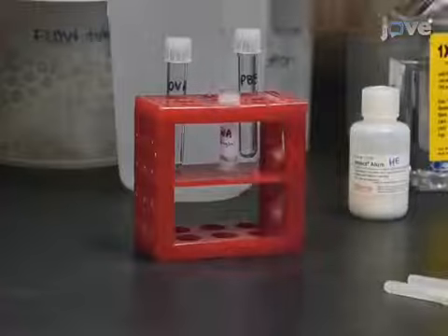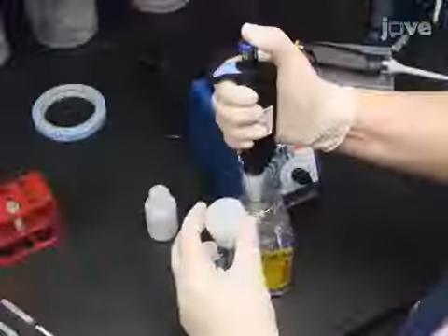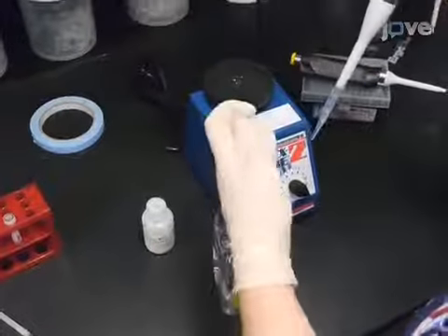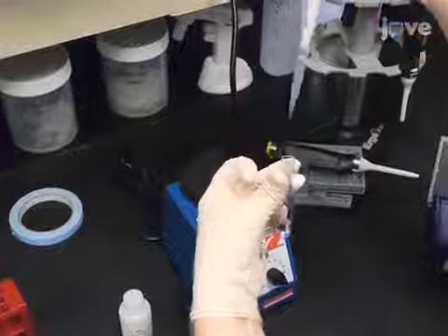Begin with bringing an aliquot of ova stock solution to room temperature for use. When at room temperature, dilute the ova stock to a 1 mg per milliliter concentration in 1x PBS. Use a 5 ml polystyrene round-bottom tube.